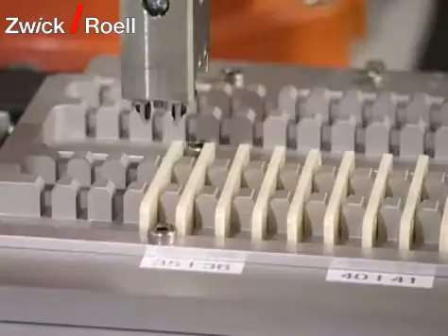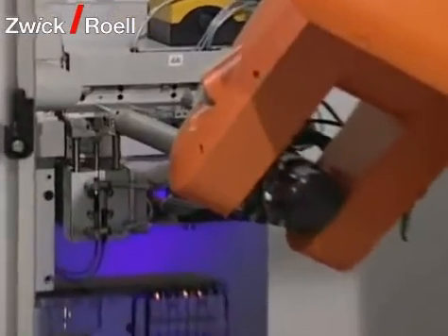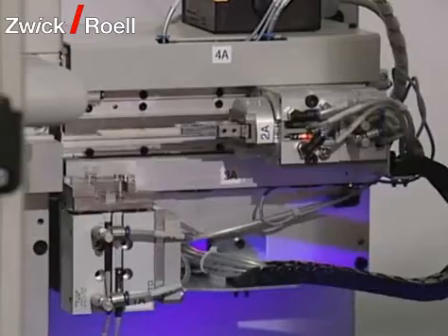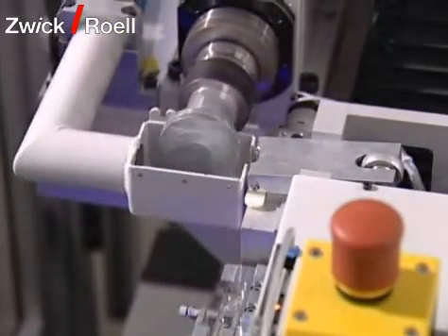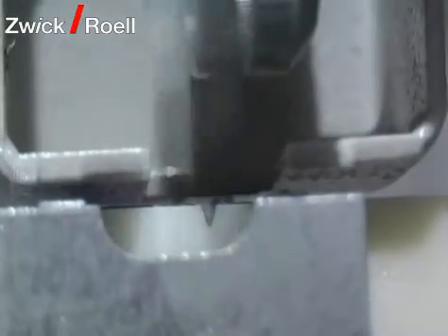The robot takes the first specimen from the testing sequence and brings it to the notch milling unit. Once the notch milling unit has received the specimen from the robot, it is clamped and the milling process can start. With this design, it is possible to notch one-sided or double-sided.